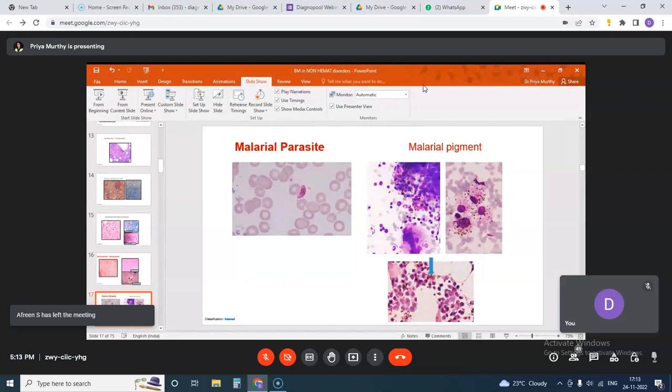Another infection that we can diagnose generally with a peripheral smear itself is the malarial parasite. The various stages of malarial parasite can be seen on a peripheral smear. But we have come across malarial parasite in the bone marrow aspirate many times in cases of PUO, when aspirate is performed for a case of PUO. And here we do come across occasional forms of malarial parasite. In this picture, you can see the gametocyte of Plasmodium falciparum.